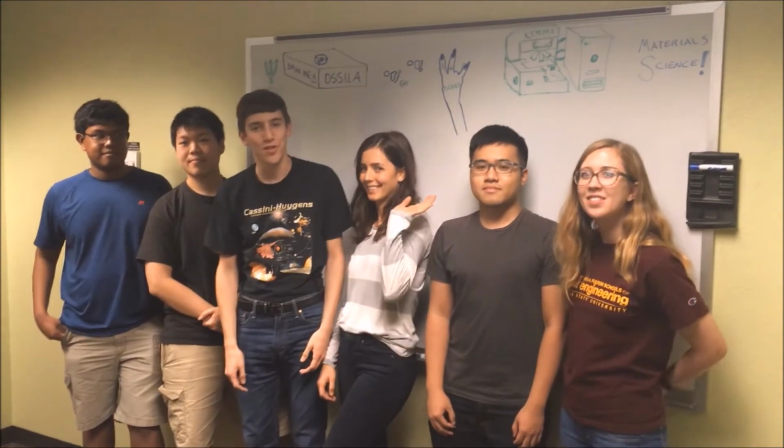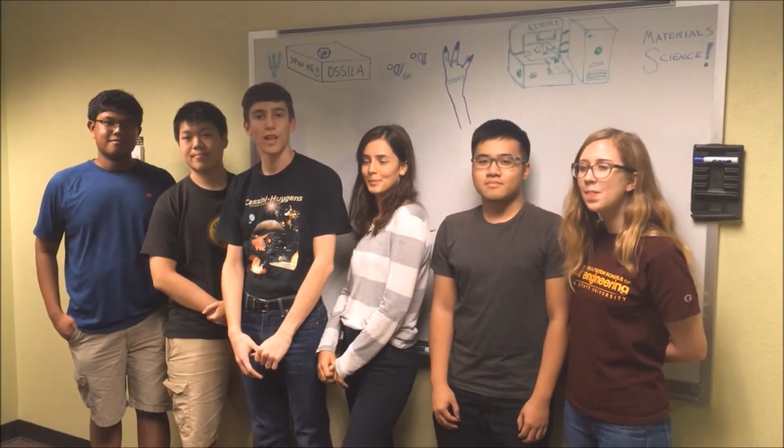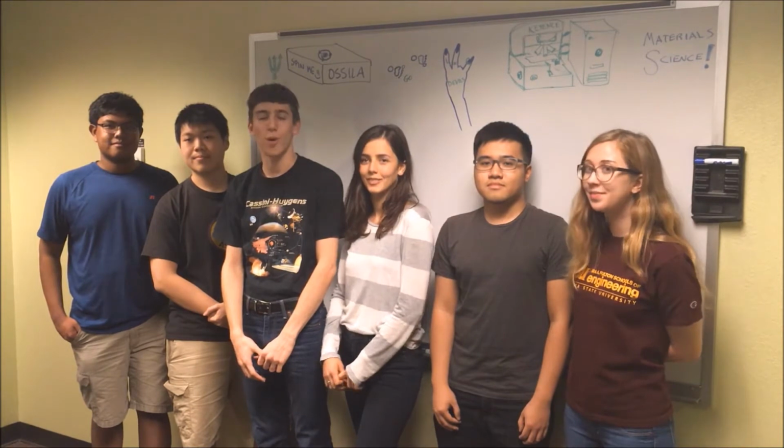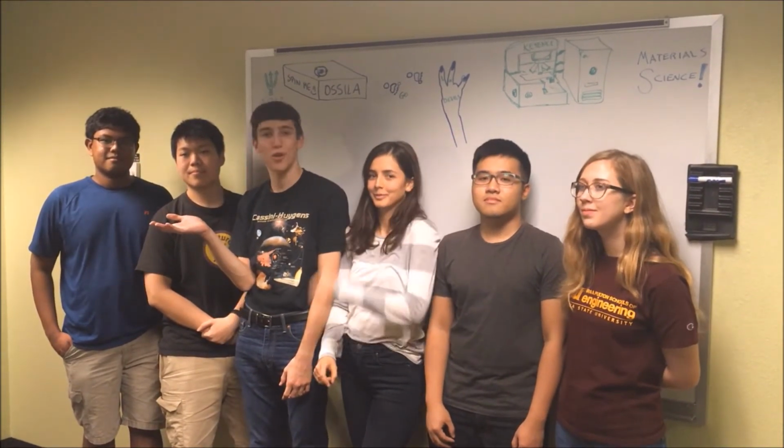Hey, we're students from Arizona State University Structure and Defects Lab, and we're here to demonstrate for you how to spin coat a polymer thin film sample and then characterize it using a confocal microscope.